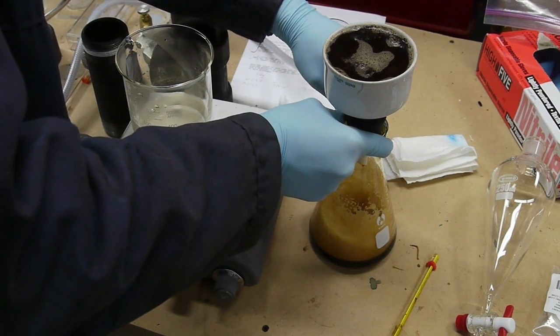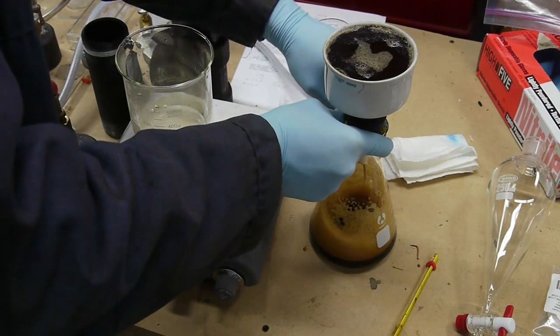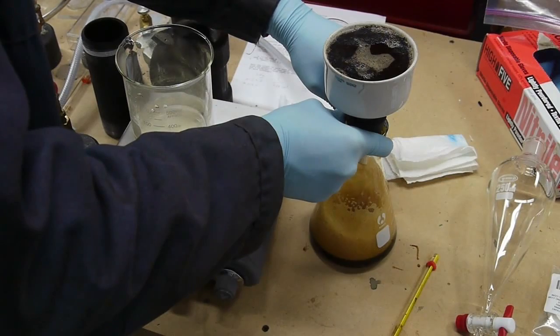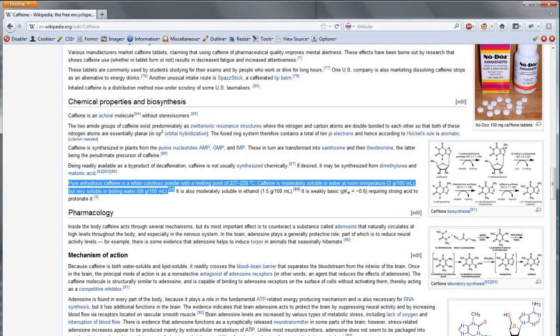You can search around on the net for your own references on how much caffeine will actually dissolve into water based on temperature - it's kind of hard to find a graph. So I used almost boiling water, at 80 degrees C or 90 degrees C, to pour through the coffee grounds to try to extract as much caffeine as possible.